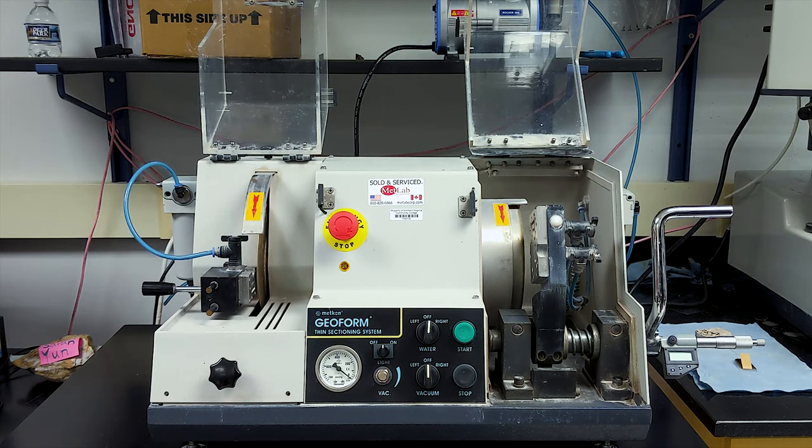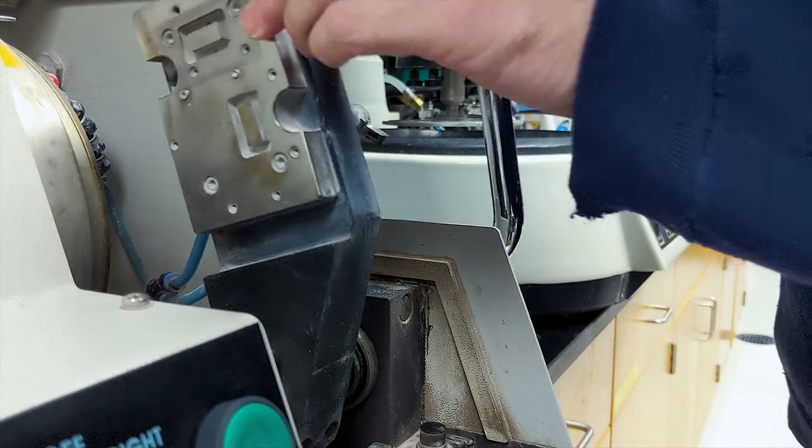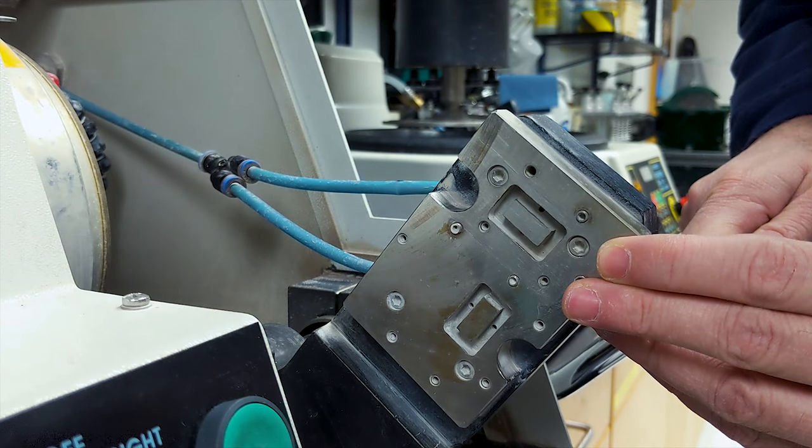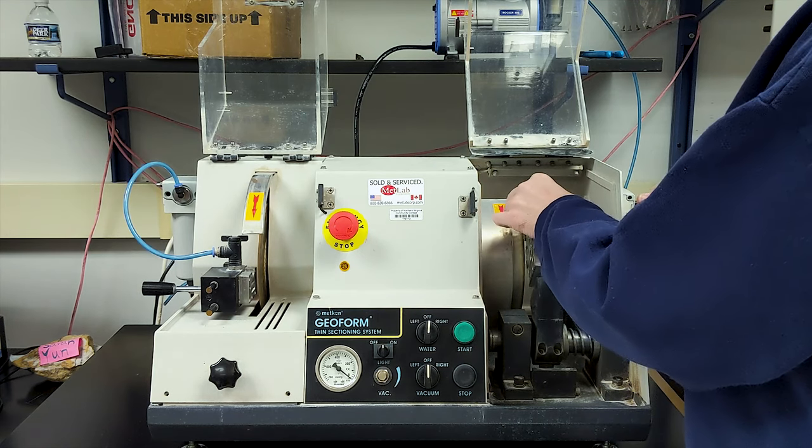On the right is the precision grinding module, where our sample slide will be fixed on a holder via the vacuum pump and carefully ground down to a thickness at or near the appropriate thickness for your thin section.